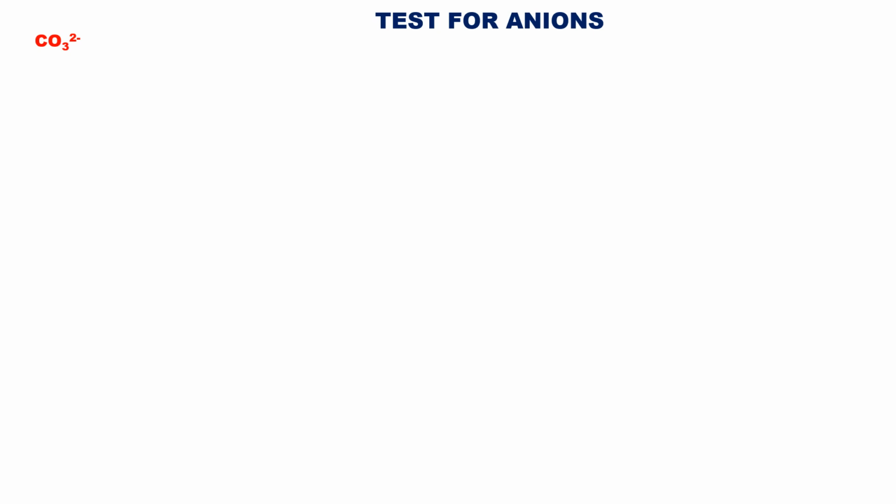So when we are testing for ions, there are special chemicals which are called test reagents that are added to the unknown ion. Let's say you are doing a practical in the laboratory and you are given a sample of an unknown chemical. You are told that this chemical contains a positive ion and a negative ion, and you have to figure out what these ions are. So this section is going to help you to identify what our missing solution would be.